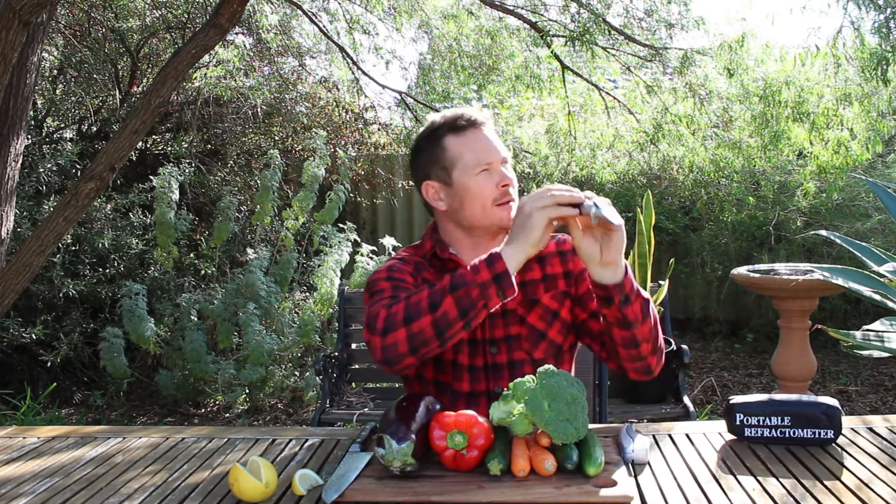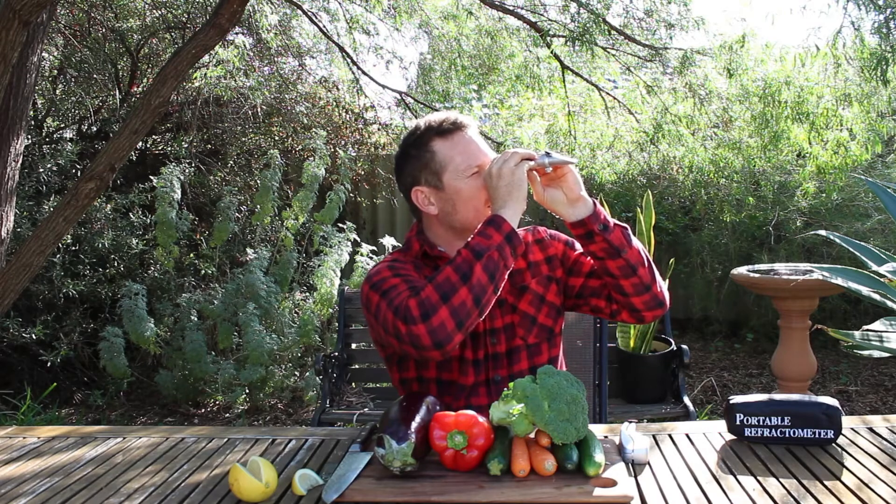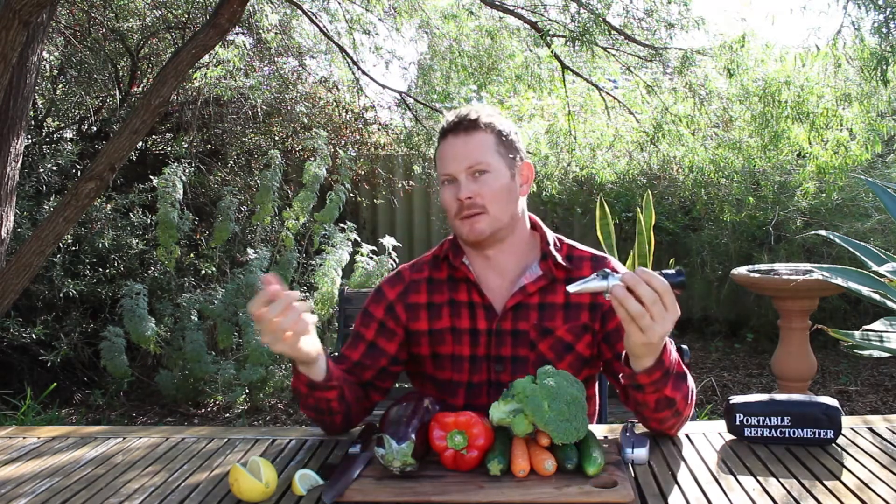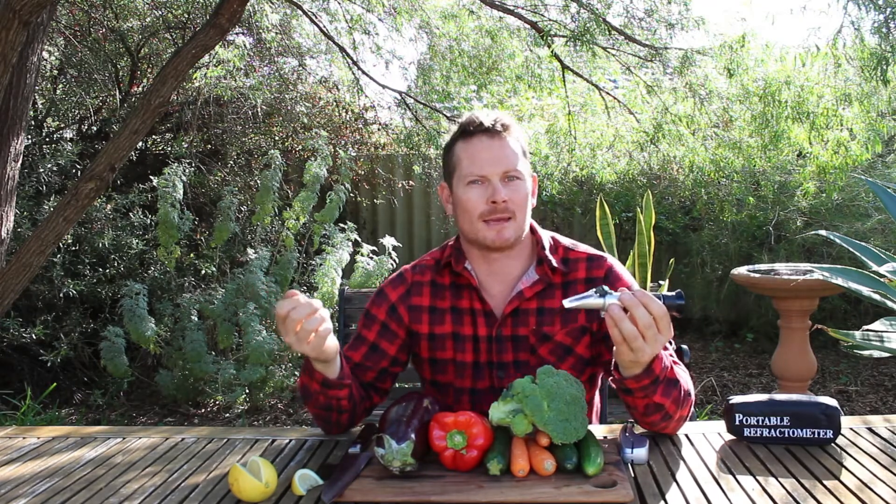Look into the light to see the reading — and this is reading 11. So 11 is pretty good for lemons; I think 12 plus is excellent. So it's pretty good. What does this all mean?